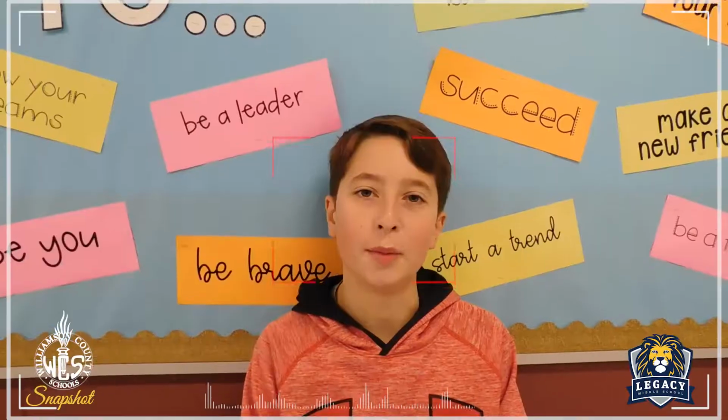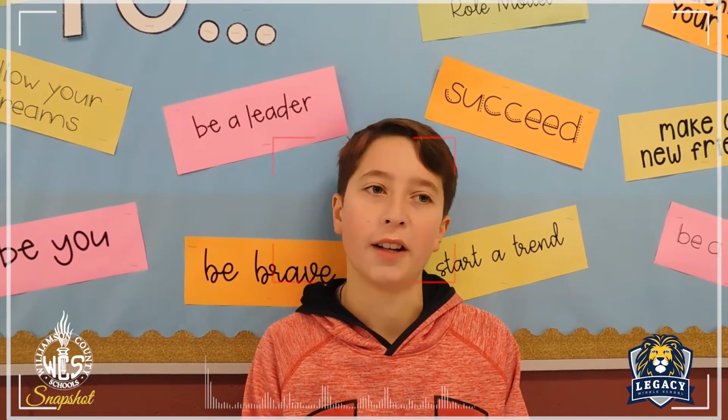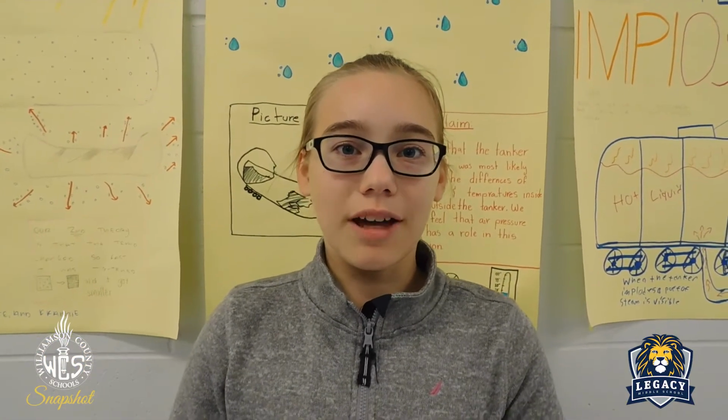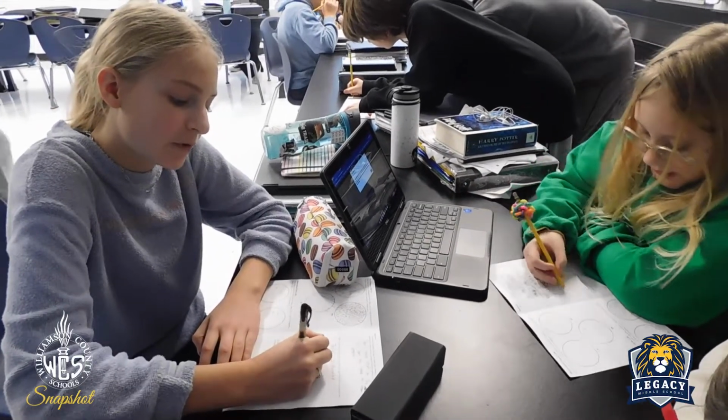So in class, we've been learning about plant and animal cells and how they're different and how they're similar. We've been looking at cheek cells and onion cells under a microscope and drawing what we see. In all the cells, there were lots of parts to them. There were tons of different organelles which had different jobs in the cell to keep it running.